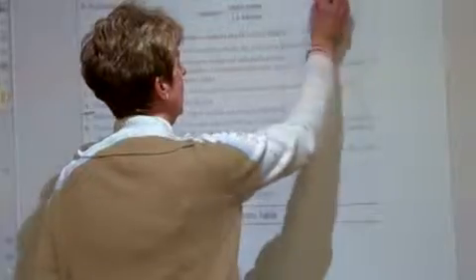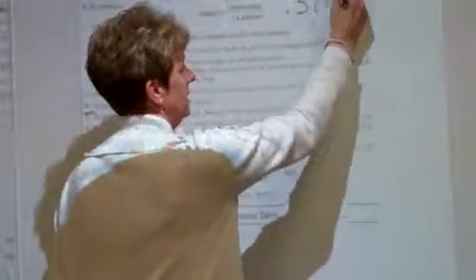Calculation 2 is just what was the molarity of the base. And if you recall, this comes from lab 21. It was 0.50100 big M for the molarity of the base in experiment 21.